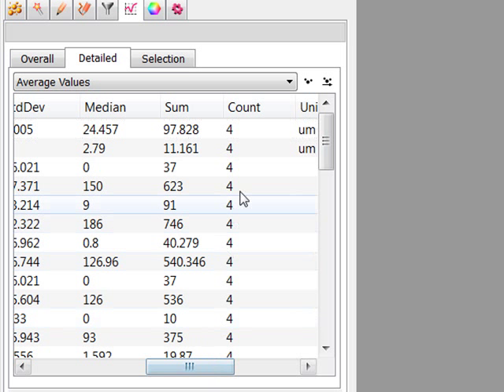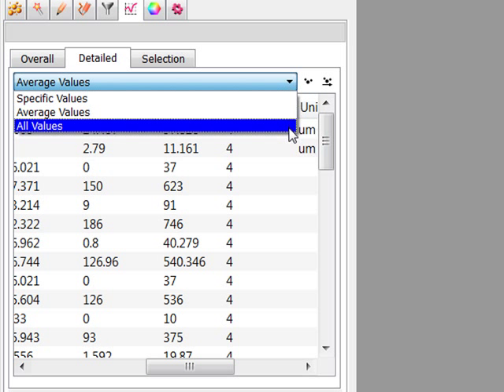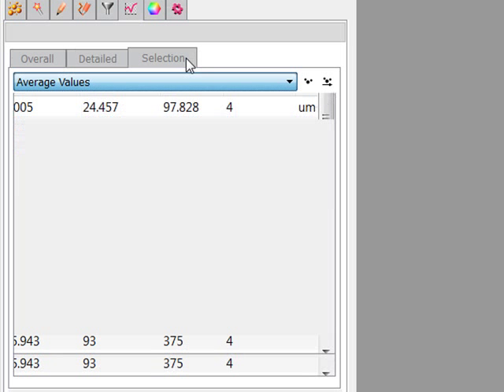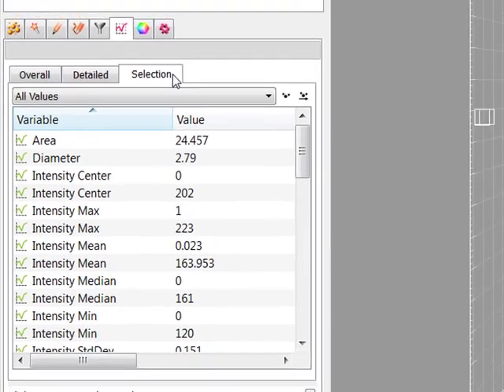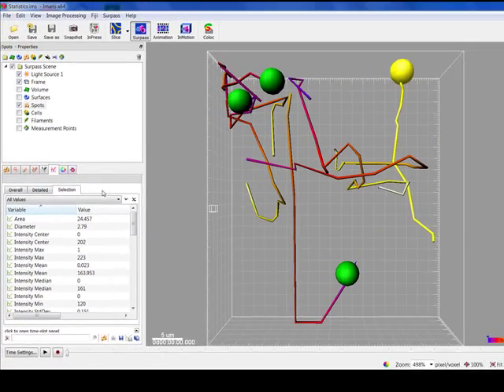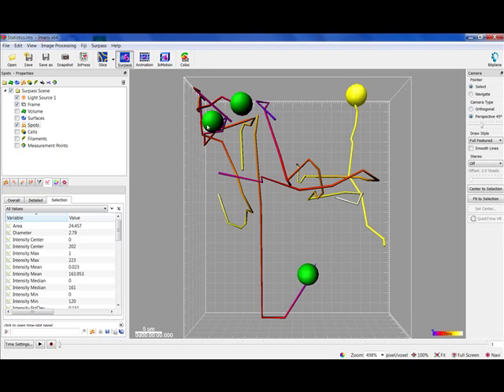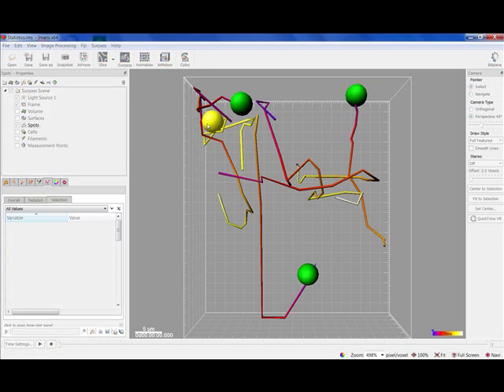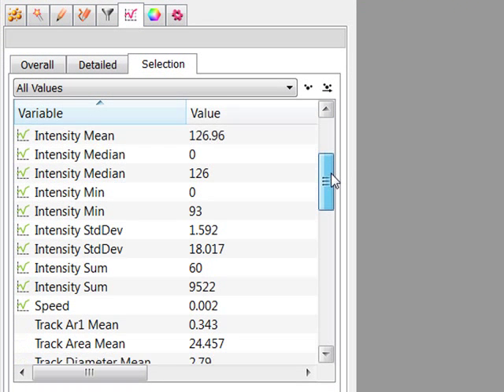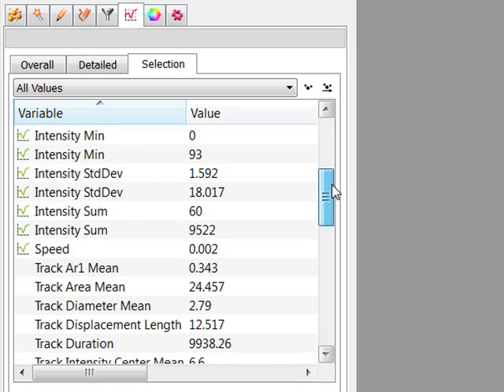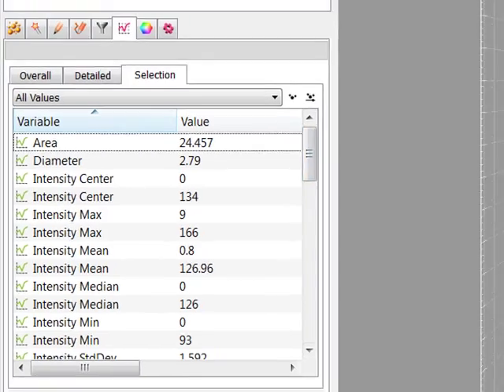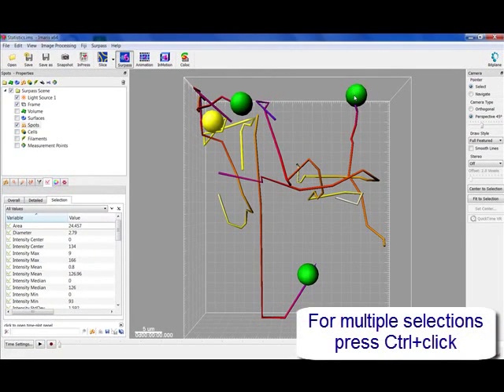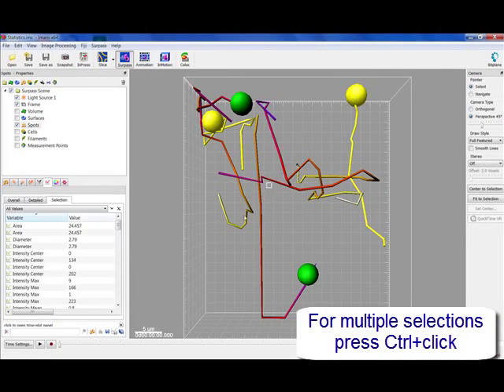If the option All values is selected under the Detail tab, all values will be displayed. The Selection tab displays values only for the selected object or group of objects. To select an object, the pointer must be in the Select mode.